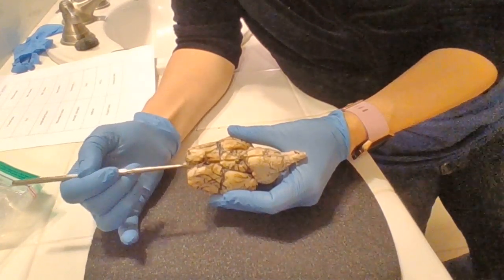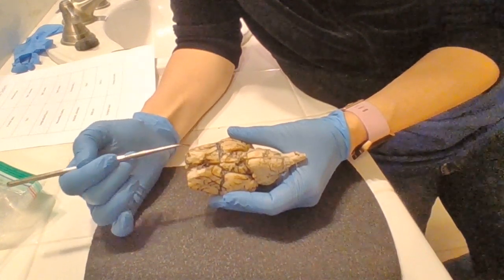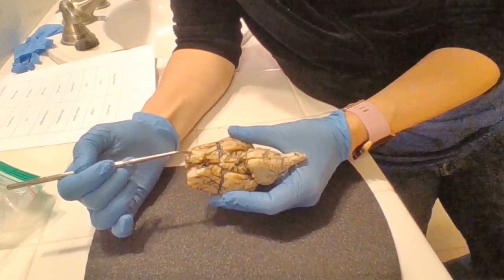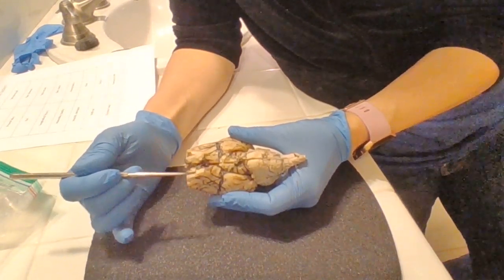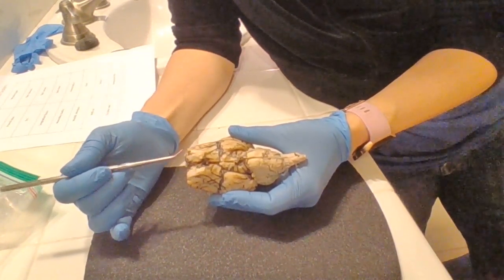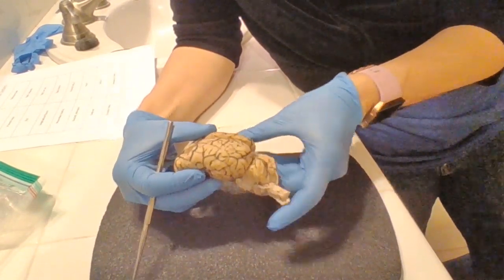cut out. Then the last thing I have is the olfactory bulb, which is right here, and the olfactory bulb has to do with smell, hence olfactory, which means sense of smell. And that is it for my dissection of the sheep's brain.